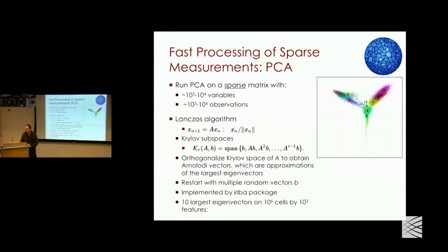Does the quality go down as a result, or is it fine? Like how deep in the spectrum? It's approximate, right? So does it get worse as you go deeper in the spectrum? I'm sure it does. Actually, we didn't do this test. We're worrying about something else. That's why we're asking. I see. Yeah, well, it's pretty easy to do, through simulations. I'm sure it's an approximate method, so you can check this. The ability to resolve it clearly would go down for the lowest one.